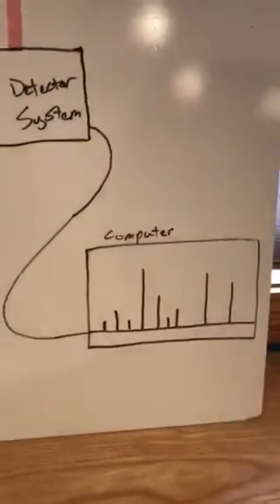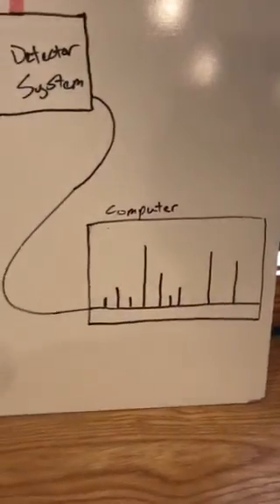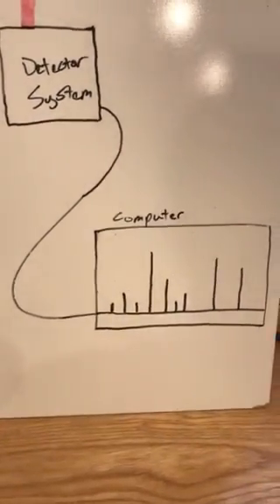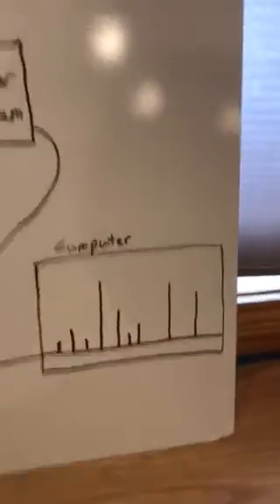Finally, we have our computer, which is able to tell us what the results of our experiment were. And so what we have here is just a simple mass spec result.